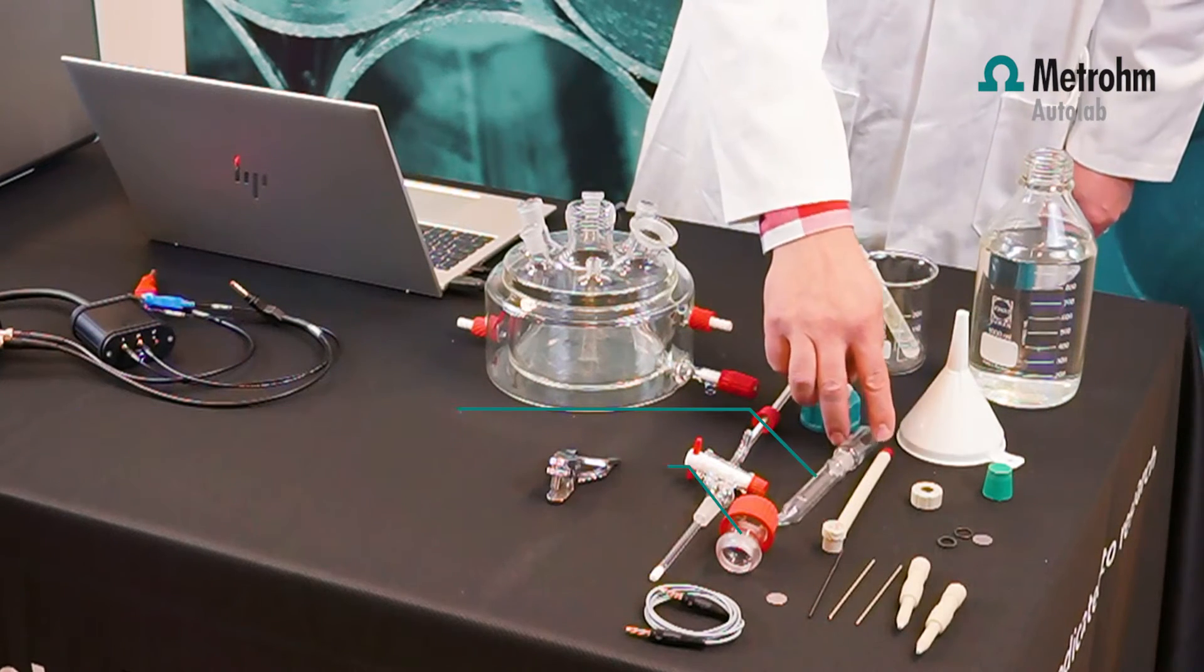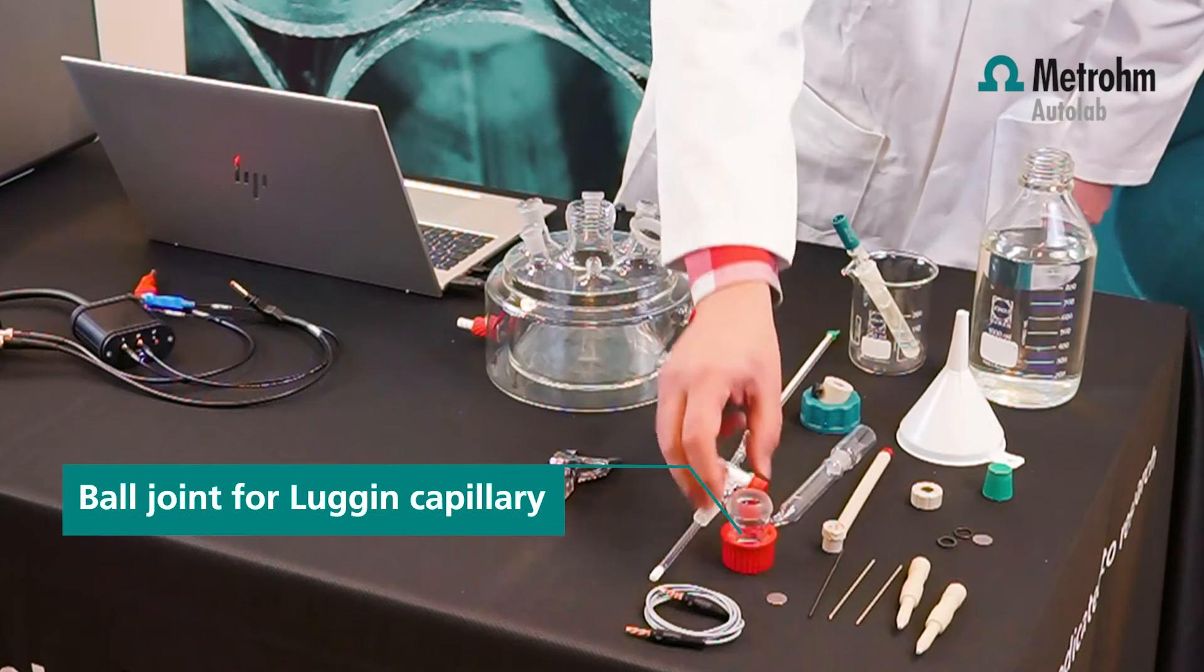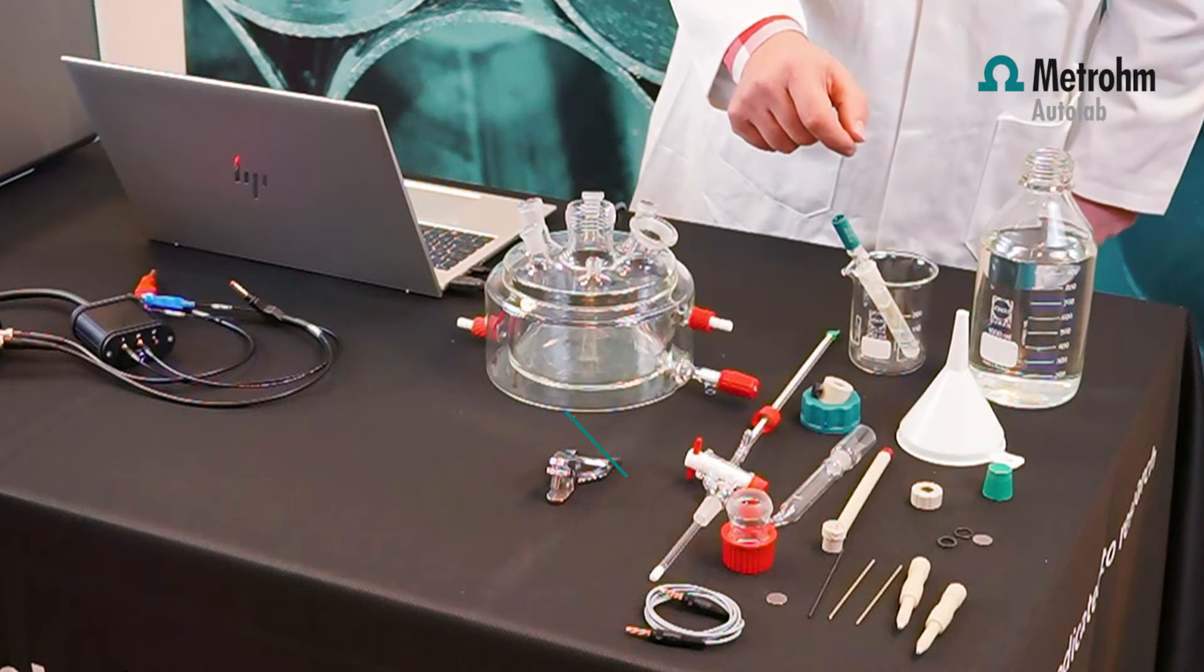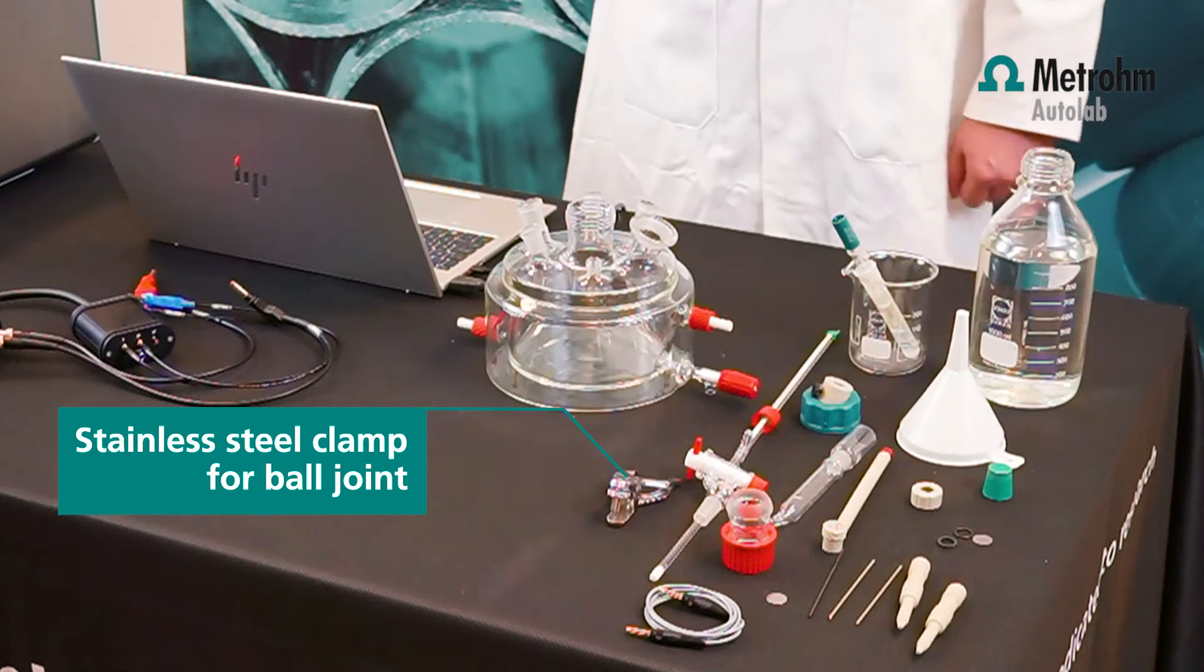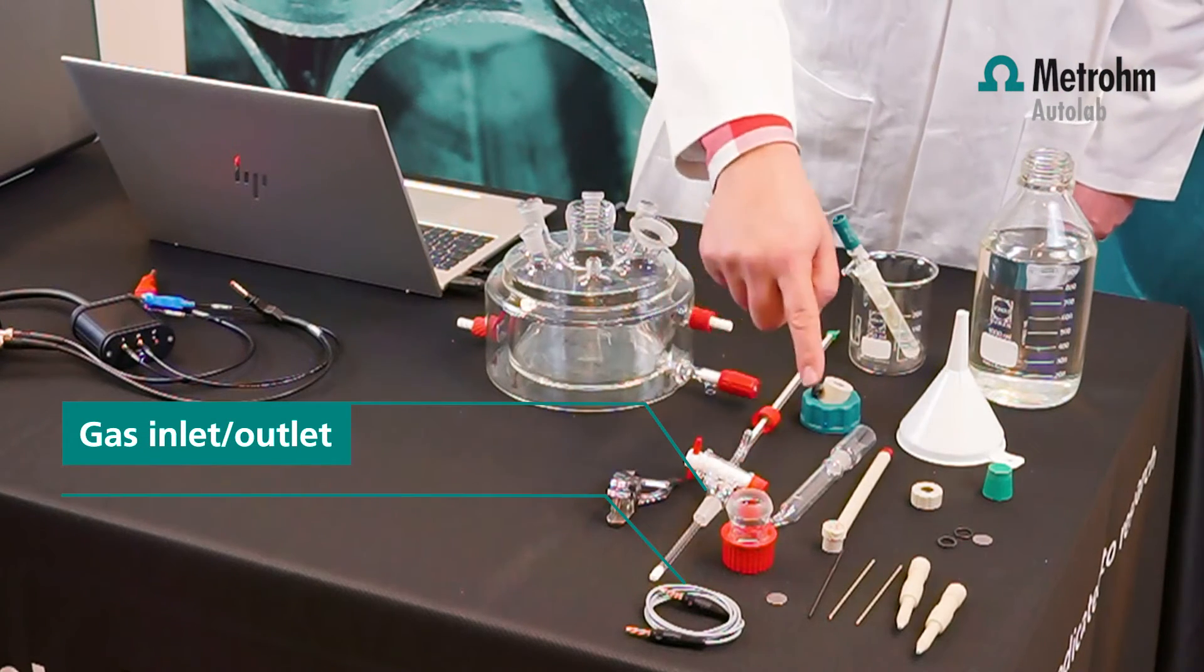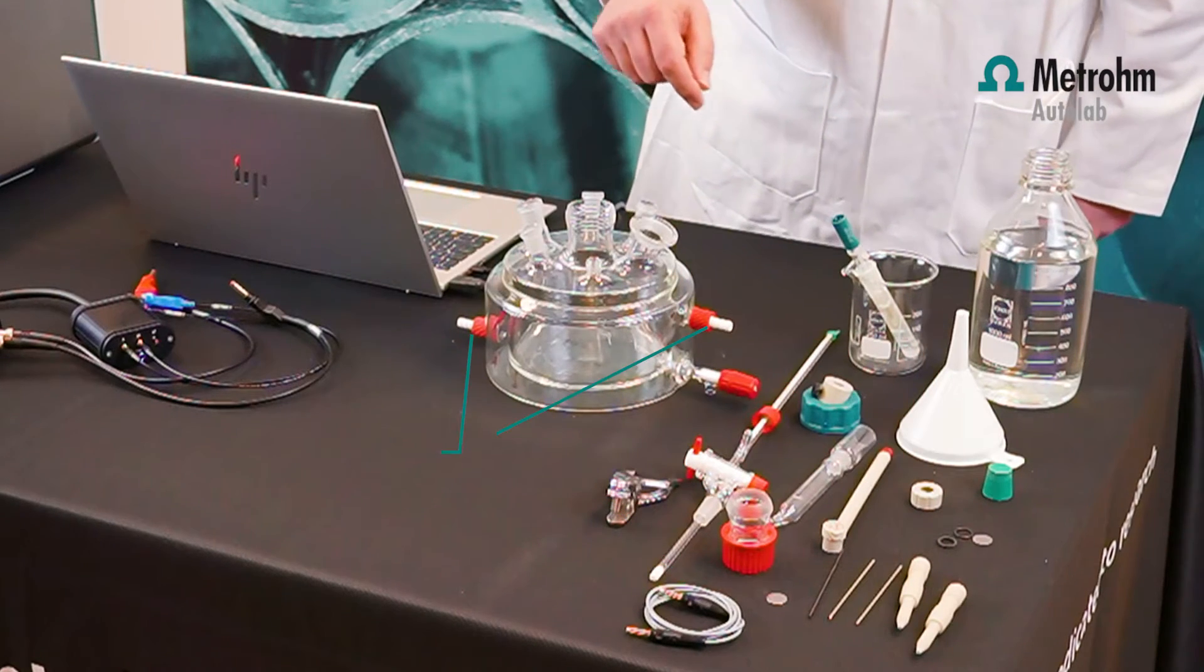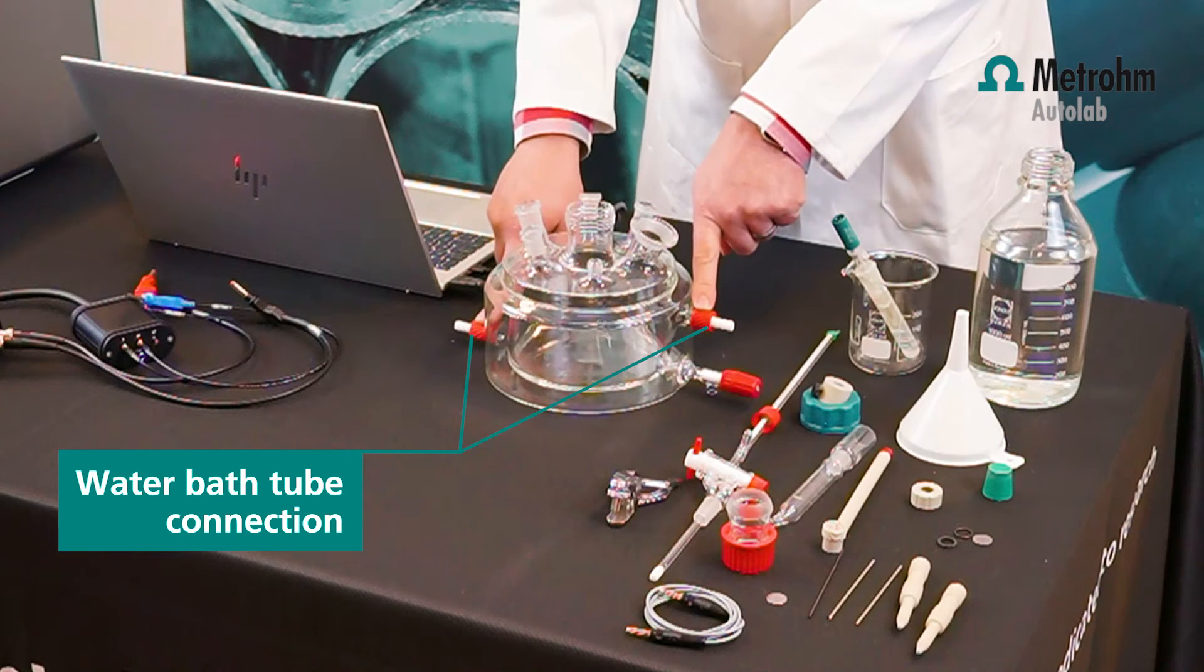A Luggin capillary, the glass part here. A ball joint to fix the Luggin capillary to the surface of the working electrode, and a stainless steel clamp to hold the Luggin capillary in position. We have a gas inlet and outlet, a cable to connect the two counter electrodes together, some open tops, and a water bath connection if you want to heat up the electrolyte.